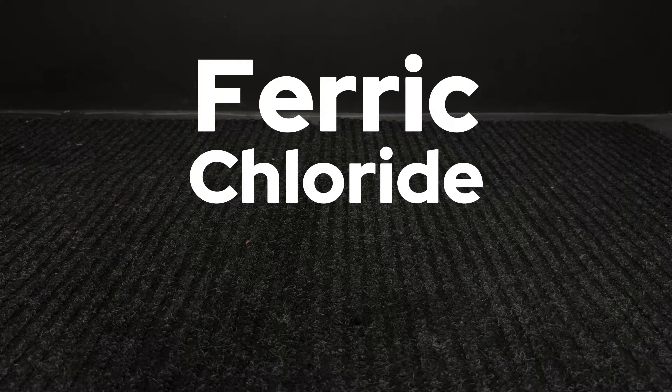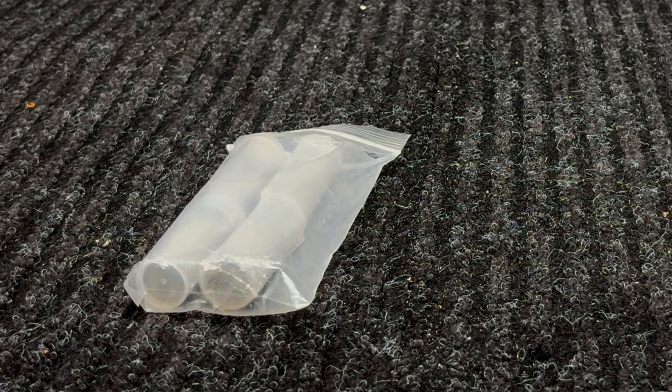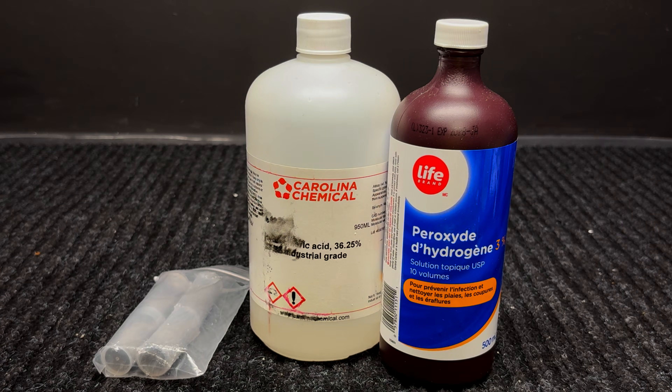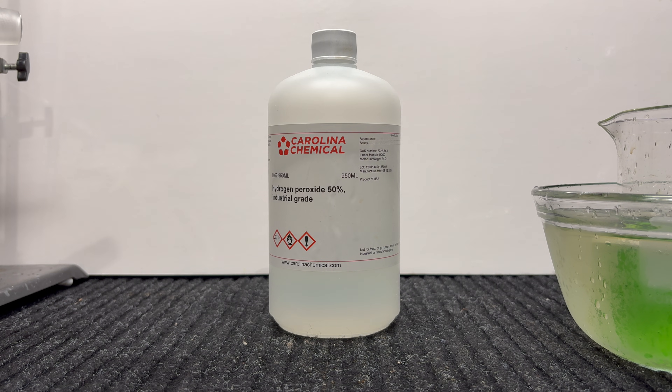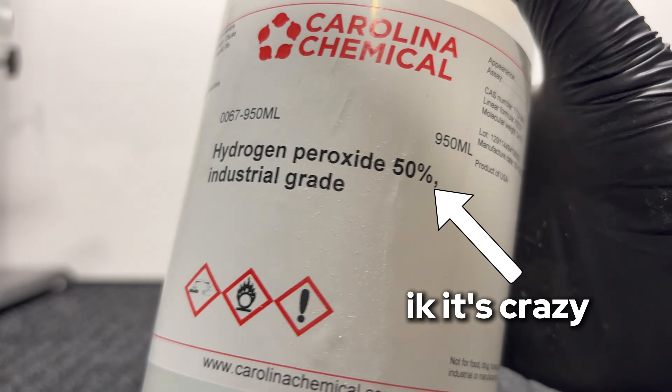Step 1: get the materials. To make ferric chloride, also known as iron(III) chloride, it is actually rather simple and all you'll need is 3 chemicals: some iron, hydrochloric acid, and 3% hydrogen peroxide. You can also use a higher percentage of peroxide if you have access to it — I actually have 50% hydrogen peroxide. Be careful though, as it might get really hot if you use too high a concentration in a later step, as the reaction is really exothermic.